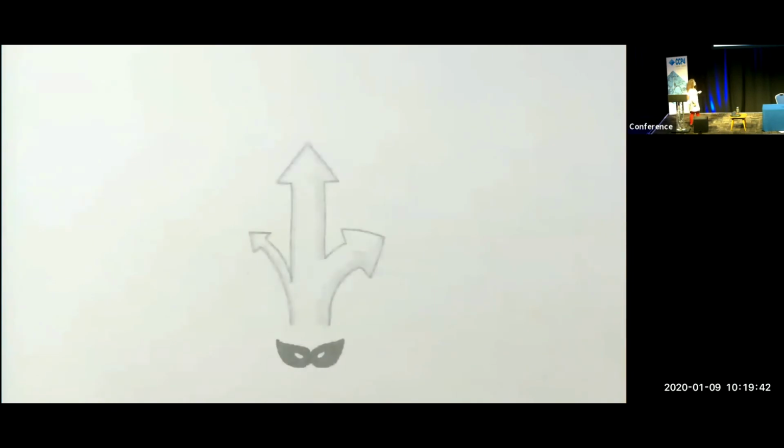So where does Vagabond go from here? Well, along the main path is actually continuing to work on the basic refinement engine, which powers this. Obviously, I need to worry about all of the small cases and so on that have been refined through the last few decades. But also, I am not fully fitting my model to the data yet, so there's still a long way to go.